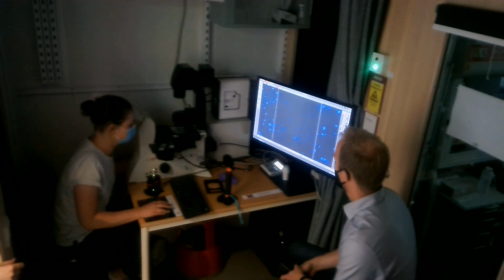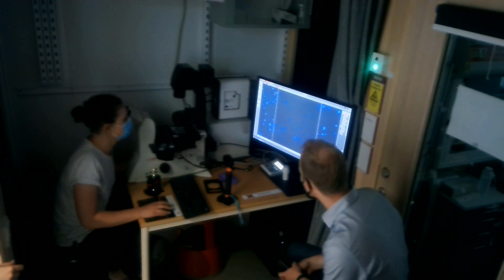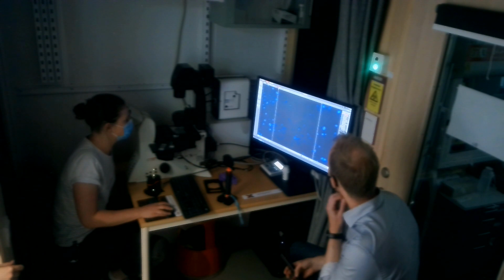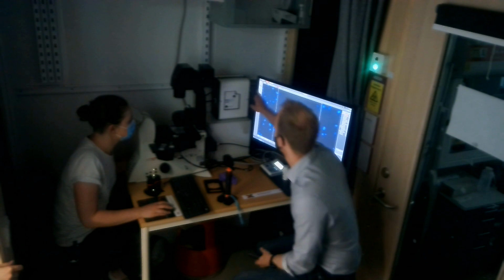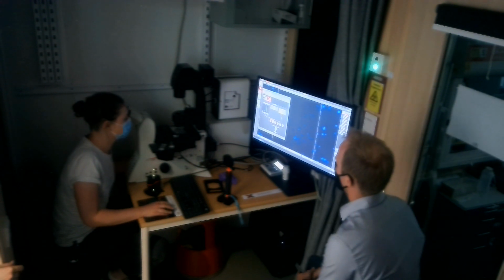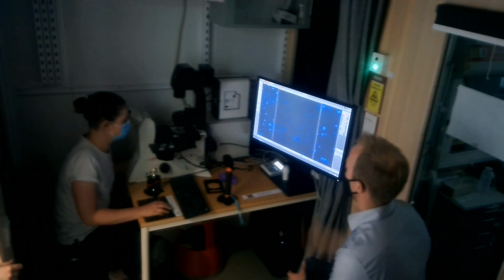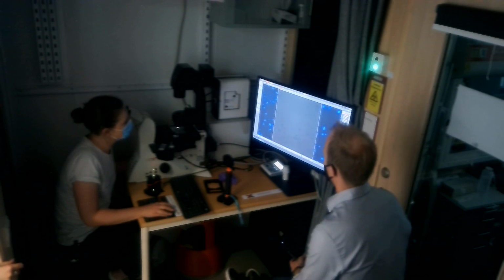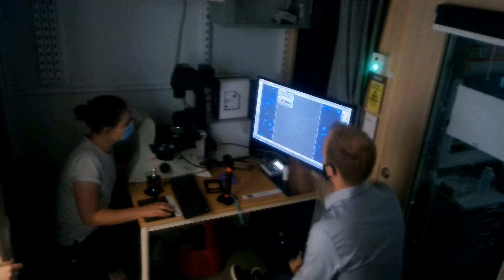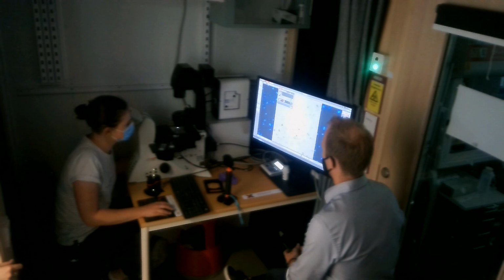in the fluorescence axis actually. Can I get a bright field? Yeah. So when you want to add another channel, you go into the beam path, and there you can add another channel. You can select bright field. Right now it's in black and white, which I think is the right thing to do. So now if you go live, you will see it also in bright field. You can adjust that if you feel like you need to adjust something. So right now this is the full dynamic range. Also that one you can increase the contrast by adjusting that if you like.